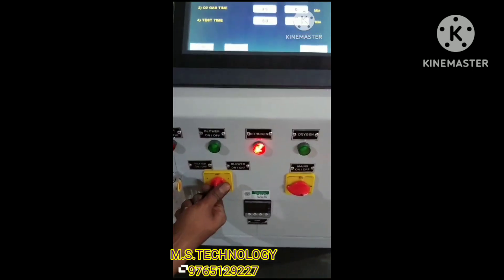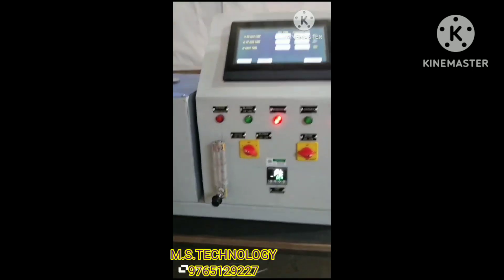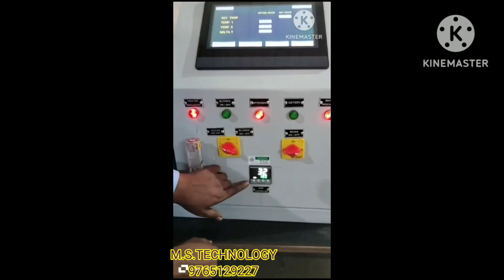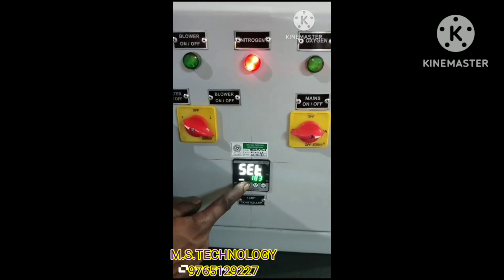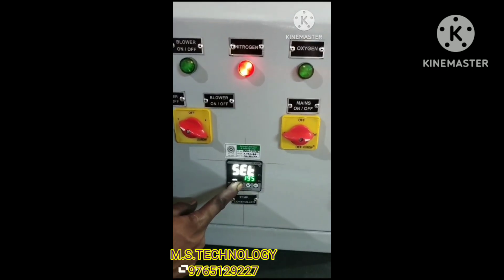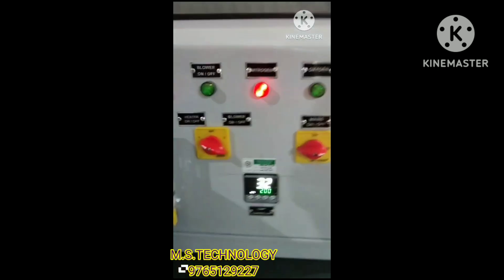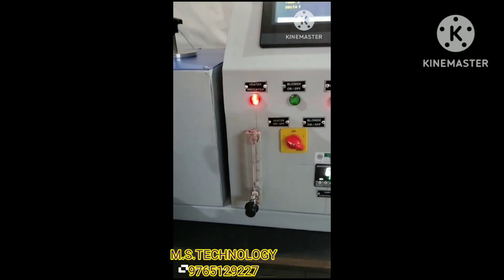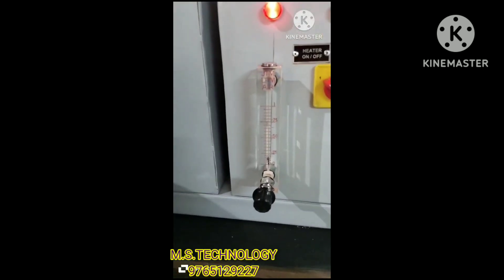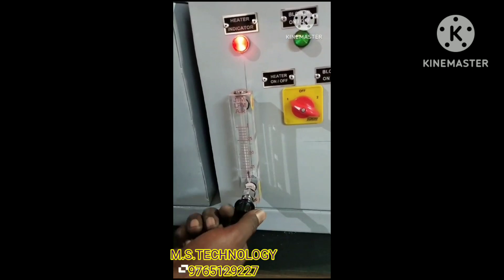The nitrogen indicator will glow. Then turn on the heater and set the heater temperature at 200 degrees Celsius. Adjust the gas flow using the rotameter at 50 ml per minute.